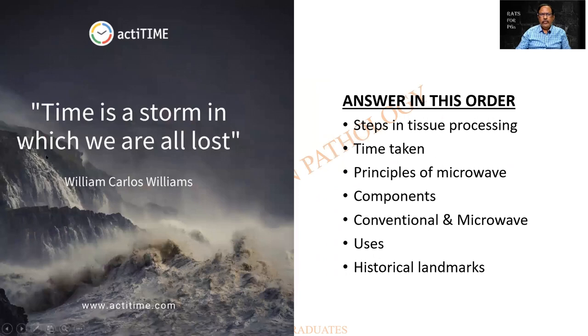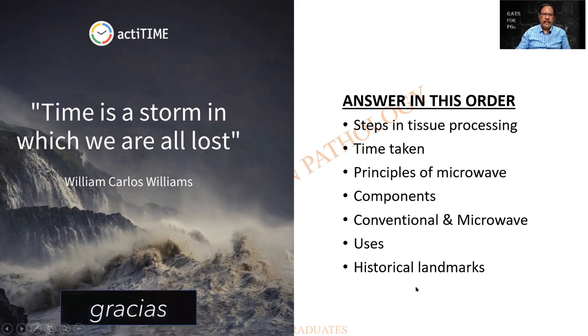Time is a storm in which we are all lost. So the main principle of microwave processing is time. And I hope you people can answer all this: the steps in tissue processing, the time taken, what are the principles of the microwave, what are the components of the machine, differences between conventional and microwave processing, uses, and the historical landmarks. Gracias.